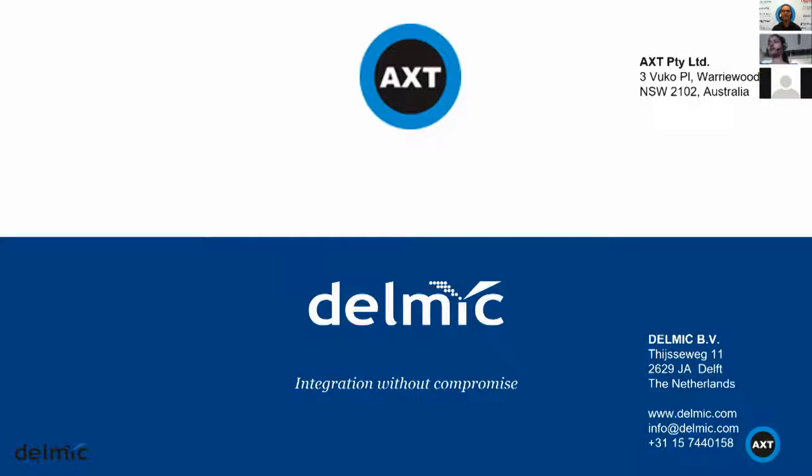Okay, great. And also another point: when we have the SECOM platform installed, can we use the SEM as just a normal SEM without the SECOM? Let's say using the normal stubs and just general SEM samples that normally facilities will have. Yeah, so it's possible to operate the SEM in its entirety. So there is nothing that is taken away from the functionality of the SEM itself.